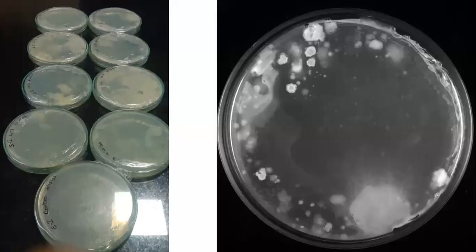So let me start from the beginning, starting with the mother plate. Imagine you are isolating bacteria from soil, water, plant leaf, whichever source it may be. The first resultant plate with the culturable microbial community is called the mother plate. From there, you will study the morphology of each and every unique bacterial isolate in the mother plate.